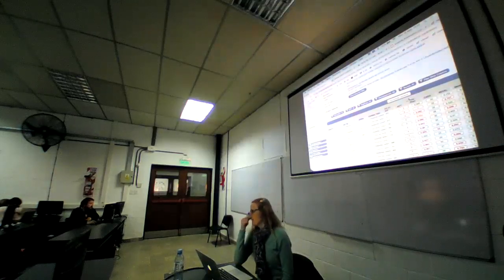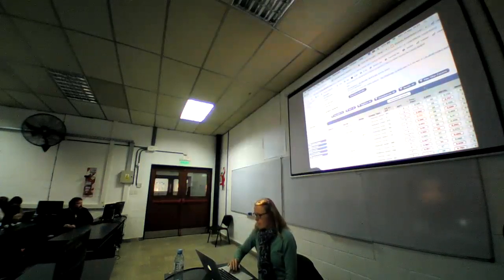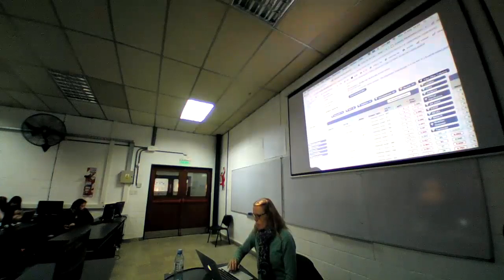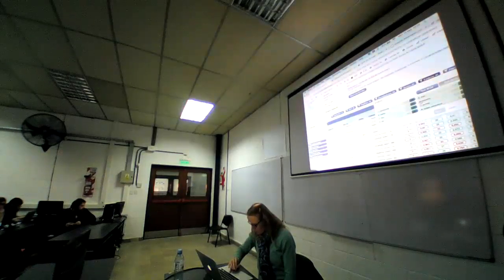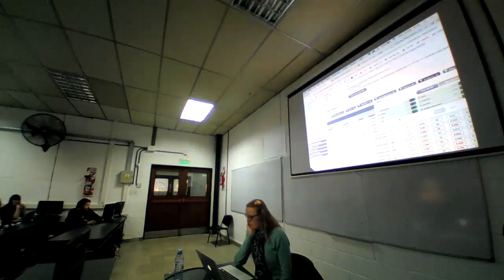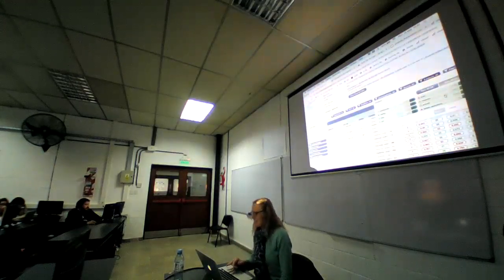Okay, yeah. There's a part in the table that says elements and there are different graphics. One says frequency, and for example, the other ones are like gnomAD, 1000 Genomes. What's the difference between frequency and the other structures? Where does this frequency come from? I think that's the combination. That's all variants for which we have frequency data, independent of which project it comes from. So it can be 1000 Genomes, it can be gnomAD, it can be ExAC, and others. I think if you add these numbers up, you may come to that. Total of 13,000. Yeah.